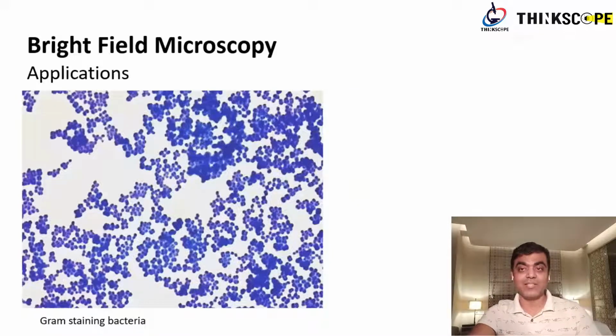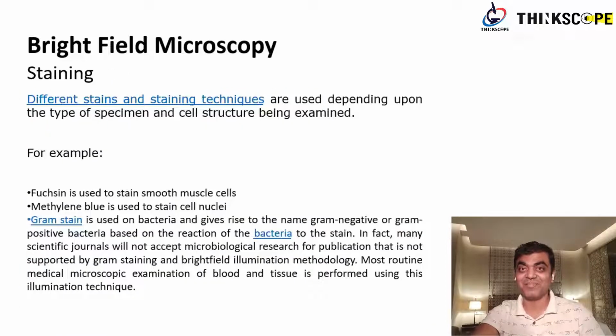Now after staining, this is one example of a Gram staining. So this is Gram stained bacteria, and you can see the culture samples. Coming to the pathological applications, where your sample has come, they culture it and they do staining. Gram positive, negative stainings are done, and then based on that they determine whether the infection is there or not. Okay, so next time when you give your sample to any pathological lab, think, is the microscope being used in the process? And I would say yes, right.